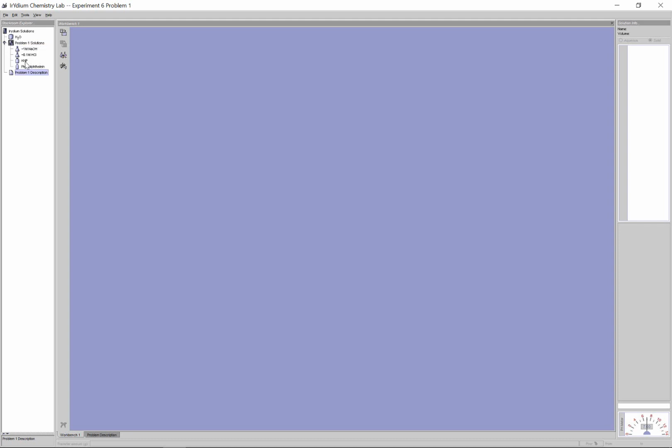We're doing part 1. If I want to pull out a solution, I can either double click the chemical or drag and drop it into my purple lab bench. So I'm just going to grab the KHP. You notice it's animated as a solid. This is a primary standard. Part 1 is going to take this acidic standard and run a chemical reaction between these two to standardize the NaOH, to get more precision on this NaOH solution. Once I have that, I can then use it to standardize my HCl solution. We notice the concentration that they've given us here is widely different.